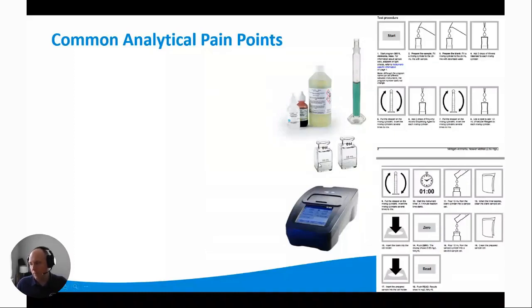And you're going to place it into one of these measuring cells, place the measuring cell into the spectrophotometer, and read the absorbance value of that sample in that measuring cell. So it's a multi-step process, requires several reagents and quite a bit of volume of sample, and also some pretty good analytical technique.